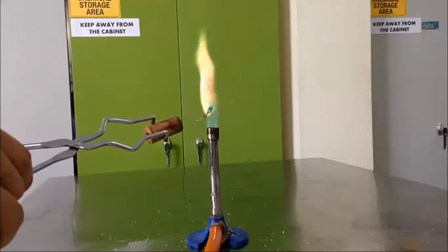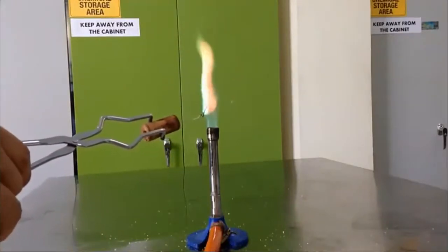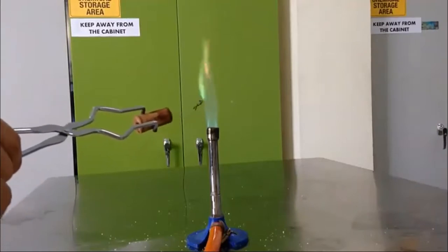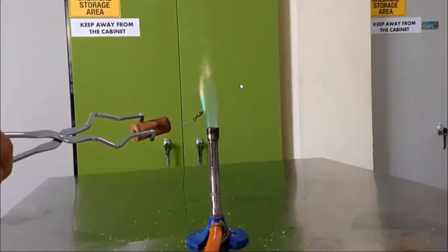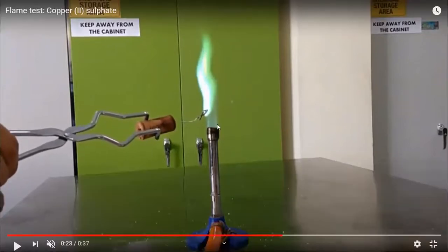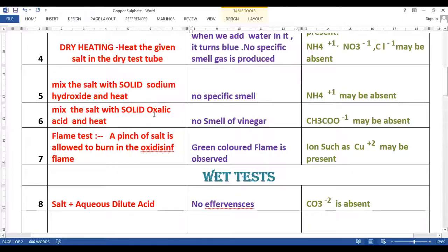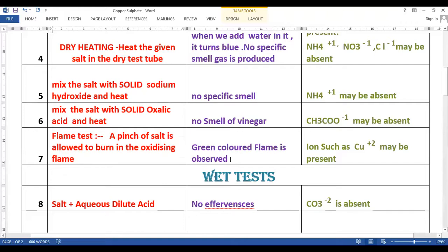You can see that various colours of the flames are produced. Let us wait until we get the final single colour. Now you can see that when we burn it, we get only a green flame. This green flame suggests the presence of Cu²⁺ ion. So when a pinch of salt is allowed to burn in the oxidizing flame, a green coloured flame is observed, and we can conclude that Cu²⁺ ion may be present.